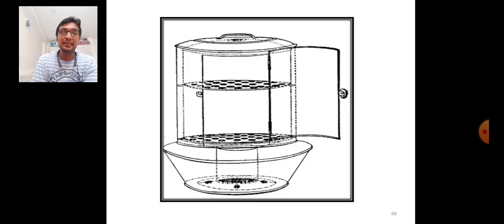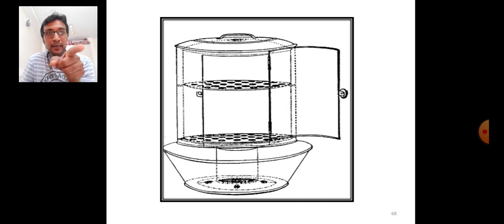बघा तुम्ही, मी तुम्हाला जसं सांगितलं, वरचं पोर्शन जे आहे that was having the perforated shells. तुम्ही जर बघाल इथे फिगरमध्ये, in this figure 2 शेल दाखवले, एक वरच्या साईडला एक खालच्या साईडला. मी तुम्हाला बोलताना सांगितलं होतं, it is just like the upper portion is just like a cupboard. आपण आपलं ग्लास वेसल, बीकर असेल, कोनिकल फ्लास्क असेल, पिपेट असतील, ब्युरेट असेल, ते इथे आपण या परफोरेटेड शेलवर ठेवून देऊ. मग या कबोर्डला क्लोज करायचं, म्हणजे हा जो डोर आहे, हा डोर क्लोज करायचा आहे तुम्हाला. डोर क्लोज केल्यानंतर खालचा पोर्शन बघा परत तुम्ही. खाली एक रिझर्वायर ठेवलं आहे, एक वेसल दाखवलेलं आहे, त्या वेसलमध्ये वॉटर भरलं जातं आणि त्या पाण्याला बॉईल केलं जातं.